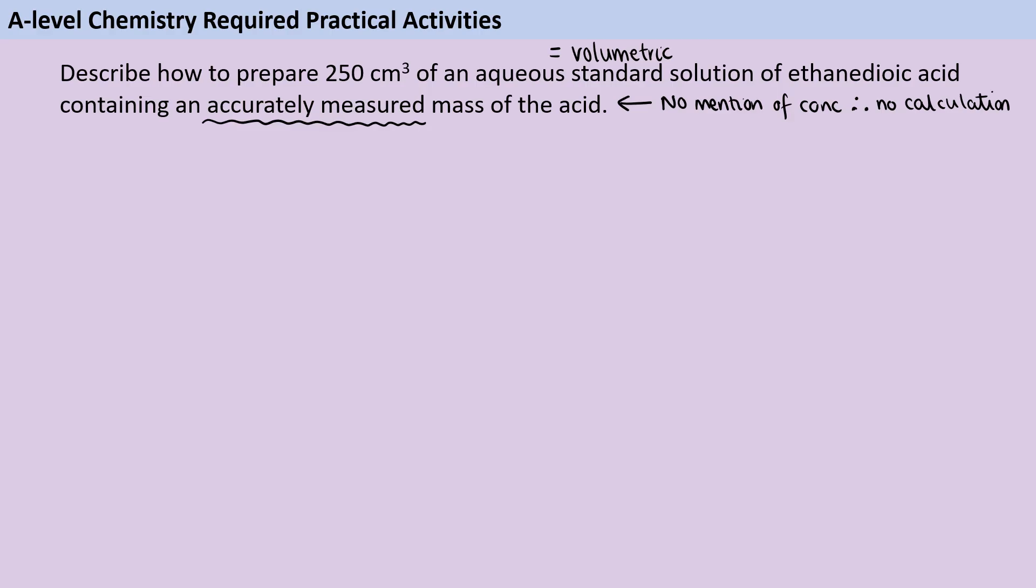So to start with, the whole point of a standard solution is that you know precisely what the concentration is, and therefore you need to know precisely how much of the compound you've added to that solution. So our first step is to accurately weigh out a dry sample of this compound, and when we say accurately weigh it out, that means using a high precision balance, or you could just say a balance that can read out to at least two decimal places.